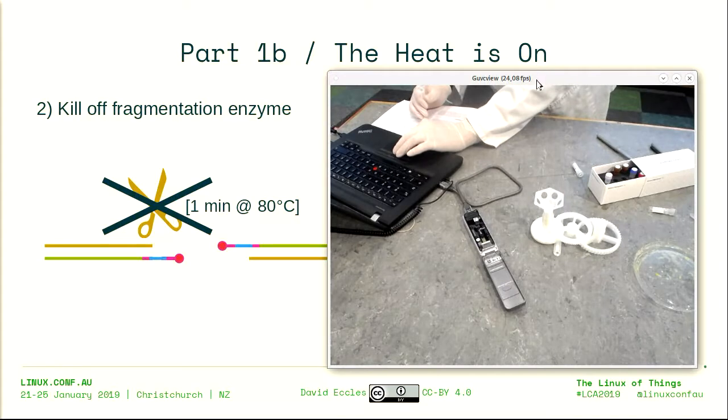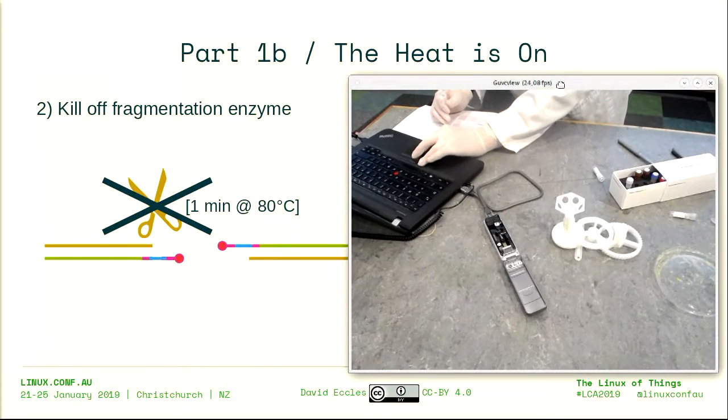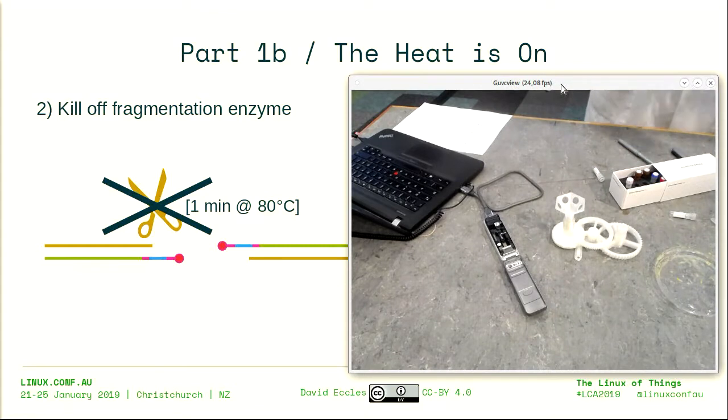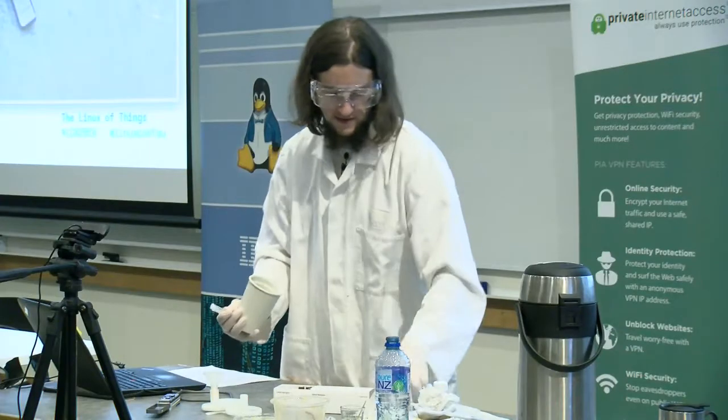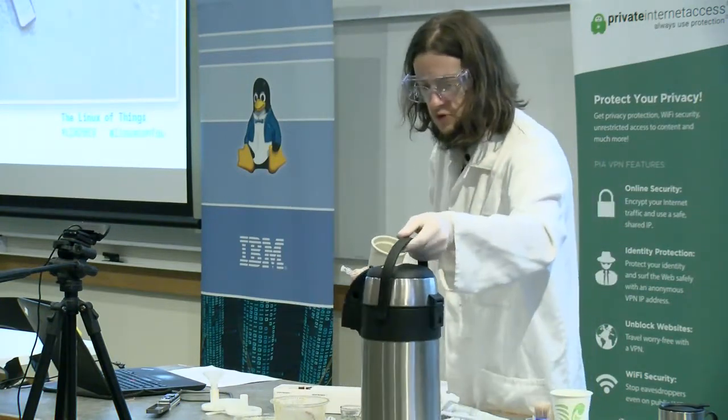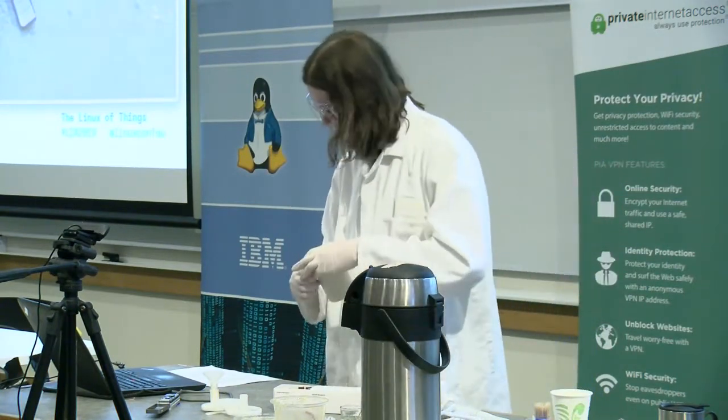Now, next, I need a source of 80 degrees Celsius heat. So, it just so happens that someone provided me with such a source.